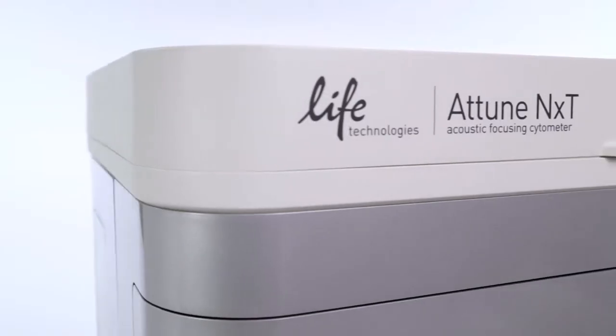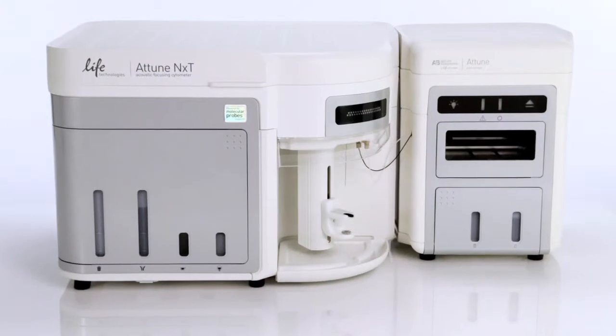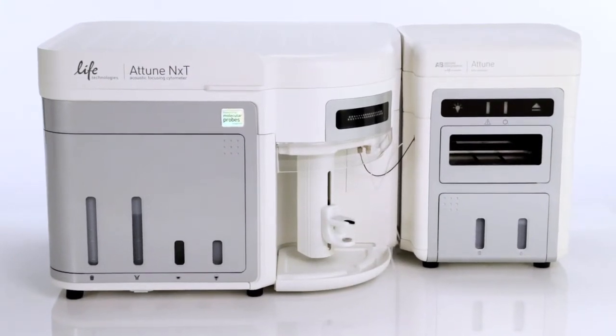One of the most annoying issues I've had in the past is when the instrument runs dry. It's easy to leave an instrument running and over time all of the fluids are used up. The instrument is dry and running air through the system, and it can take a lot of time and effort to recover from this.